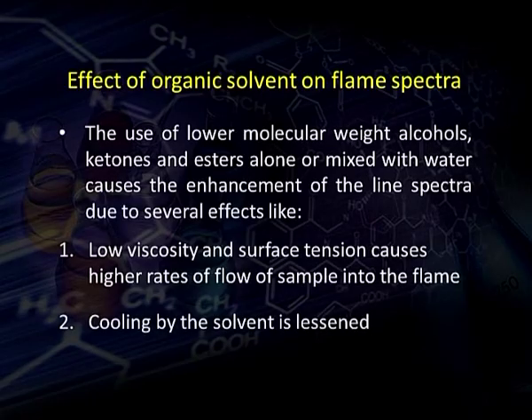Coming on to the effect of organic solvent on flame spectra. The use of lower molecular weight alcohols, ketones, esters alone or mixed with water causes the enhancement of line spectra due to several effects. Number 1, low viscosity and surface tension cause a higher rate of flow of sample into the flame.